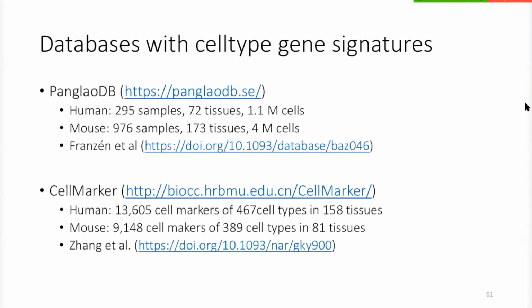There are these two databases that collect marker genes. I think that's already nice if you don't know anything about the system, but in reality, you always know something about the cells. So I'm not sure if it's useful, but I think they are quite nice resources. They are a bit biased to mouse and humans. So if you also do other organisms, you're on your own.